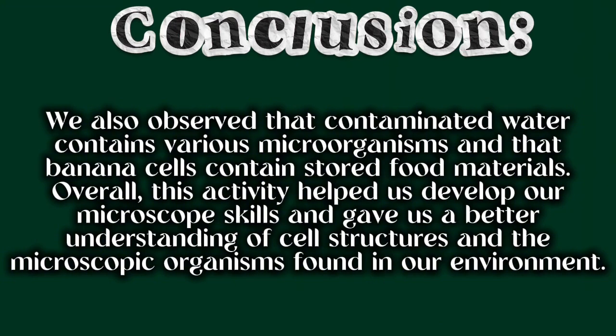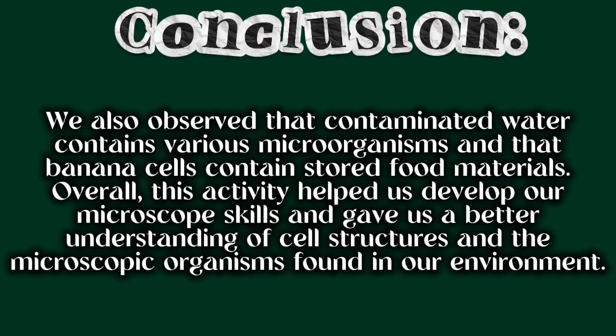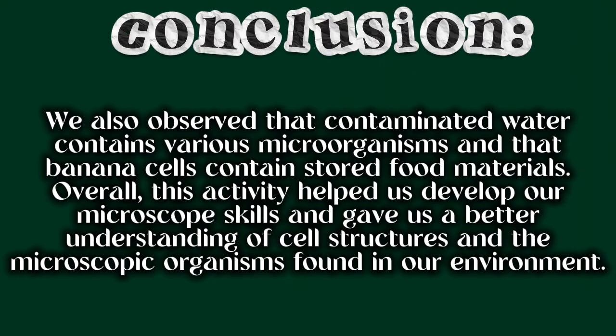Overall, this activity helped us develop our microscope skills and gave us a better understanding of cell structures and the microscopic organisms found in our environment.